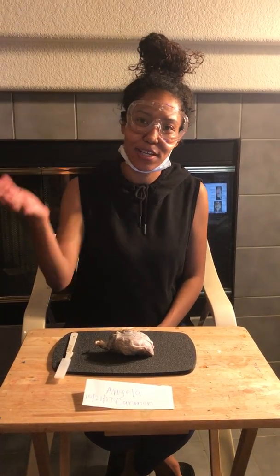My name is Angela Carmen, and today I will be dissecting a sheep brain and going over the gross anatomy of the central nervous system. Come take a closer look.